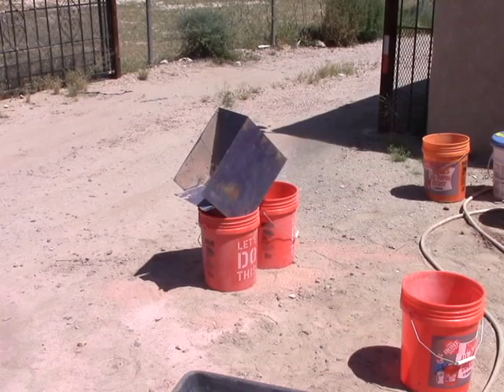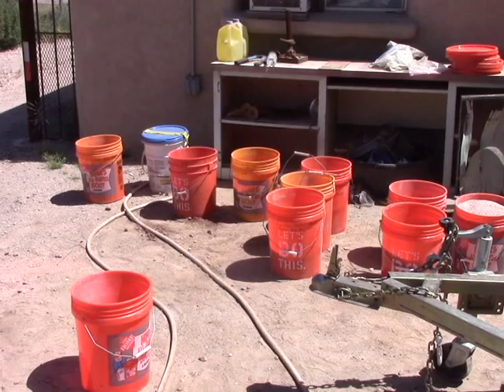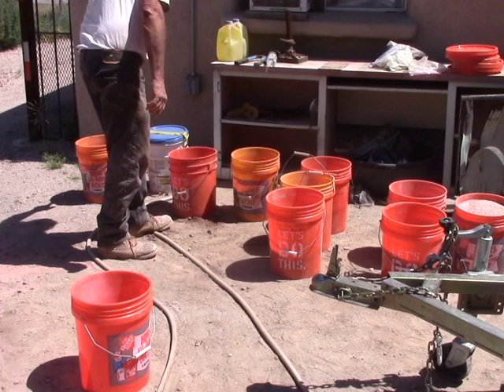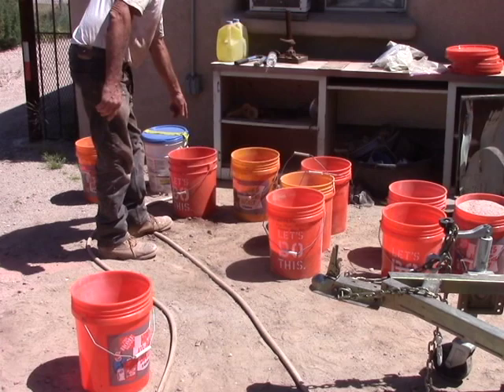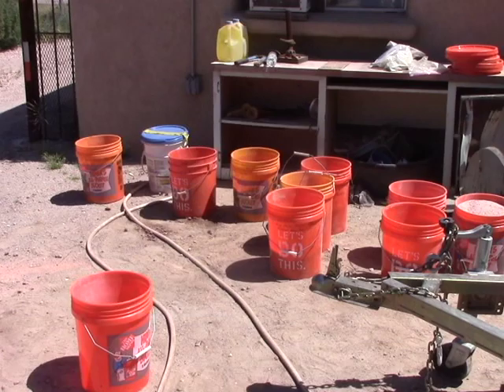So the first thing I do once I've got everything crushed is I will sit here and lay them out in order — the actual geometric order that they were. For example, these are vein plus footwall, this is footwall, and this would be the south end of the south vein, north end of south vein, south end of north stope, north end of north stope. Makes it real easy to keep track of things.